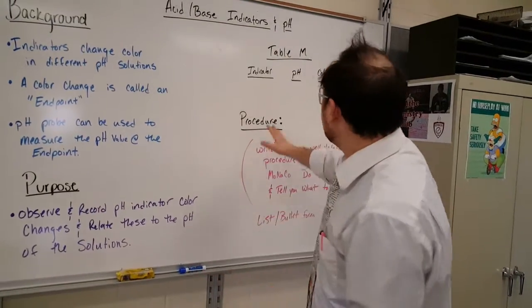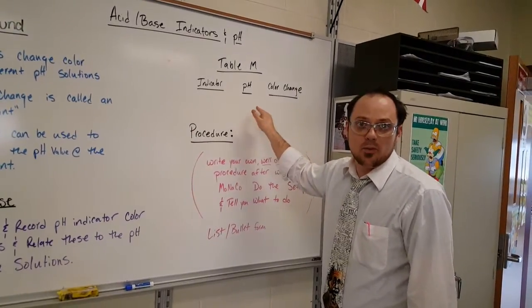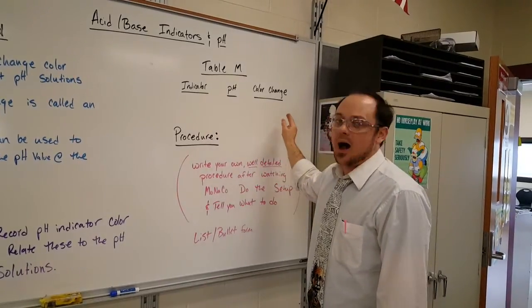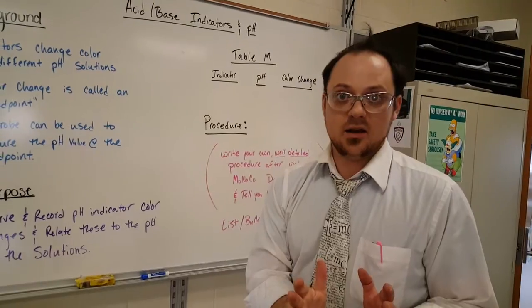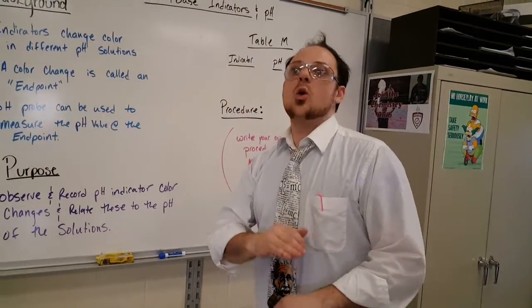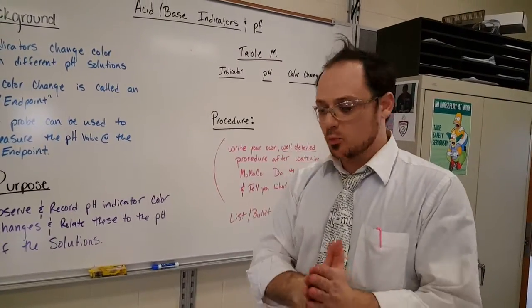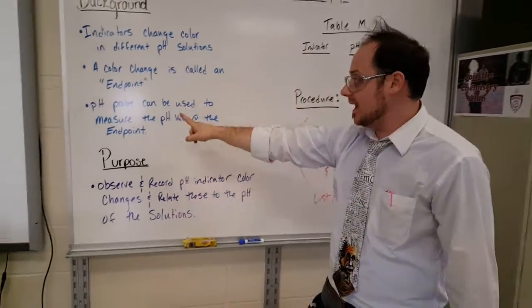So if you're looking at table M, pH indicator range, you're going to see 0.4, we're going to actually see your endpoint probably beyond that spot. But that's okay for today. This isn't a titration, so it's not a perfect neutralization. We have that set up for the next lab where technique really does matter. So we're doing brute force, relating color change to pH at the endpoint.